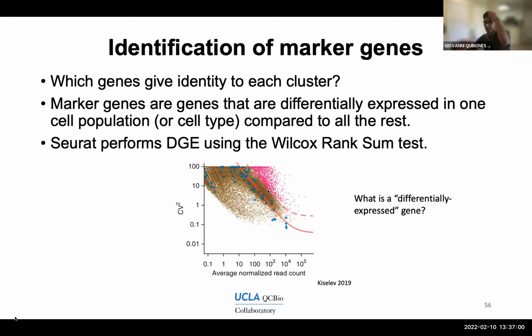And so in trying to quantify, for a gene with, say, an average normalized count of 10, how much variance do I expect? If this same gene has an average expression of 20 in another condition or in another cell, is that difference of 10 significant? How can we figure that out? And there have been many methods trying to deal with this issue.